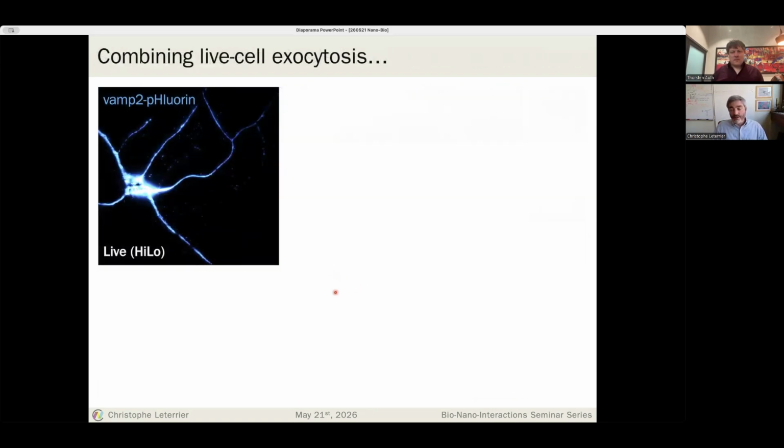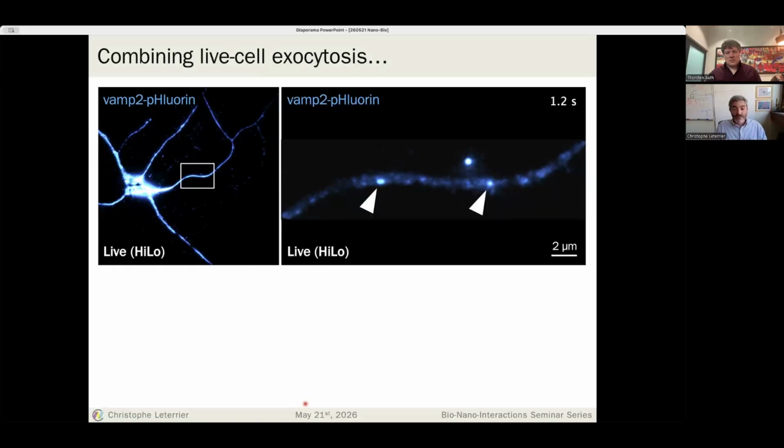Next, we wanted to know, if there is exocytosis along the axon, does it also need a hole? It needs to access the plasma membrane. So how does it work? Do you have holes in the spectrin that allow the exocytosis to occur? To do that, Teresa set up a correlative approach of live cell imaging and STORM. So we're not doing correlative STORM and PREM like we did for endocytosis. We do live cell imaging, then we fix and we do STORM. And that works like this.